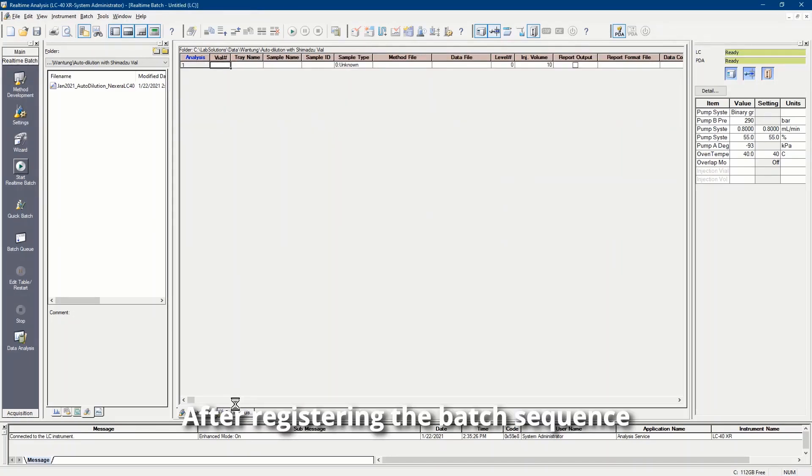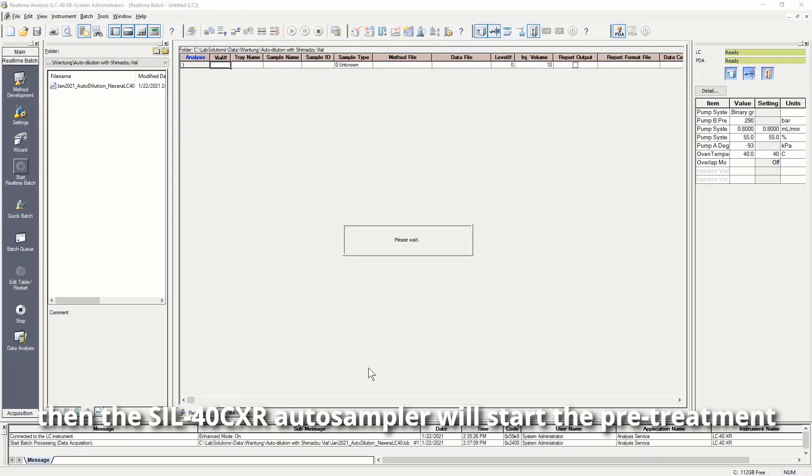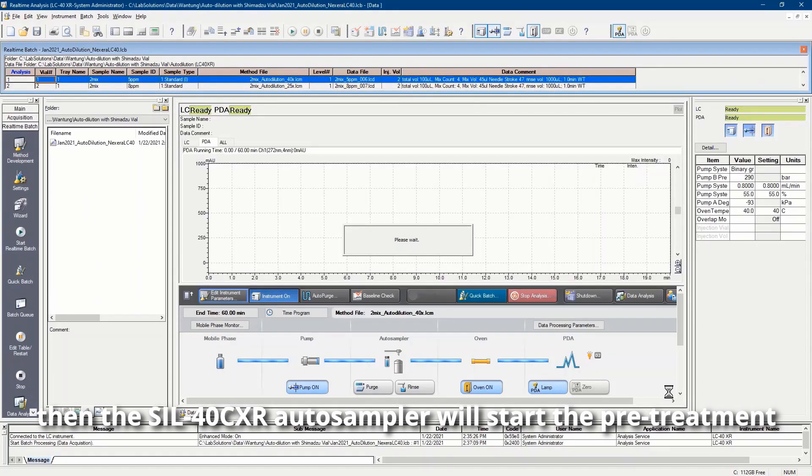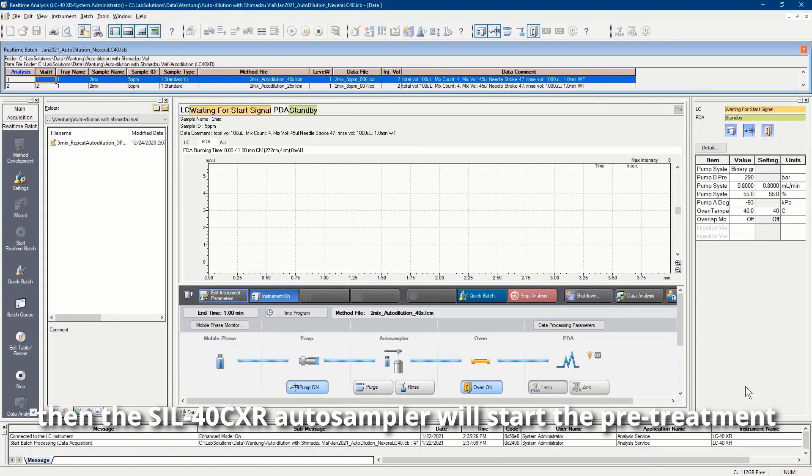After registering the batch sequence, the SIL-40 CXR autosampler will start the pre-treatment.